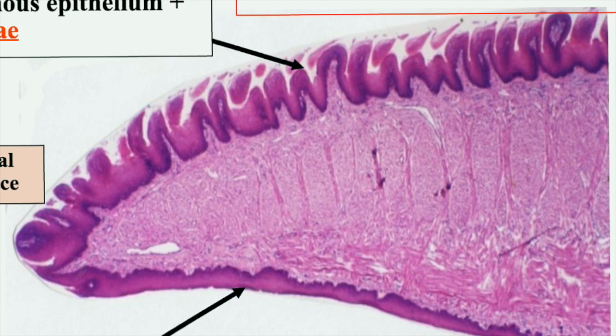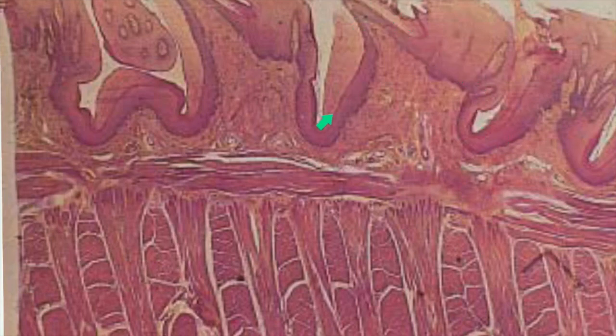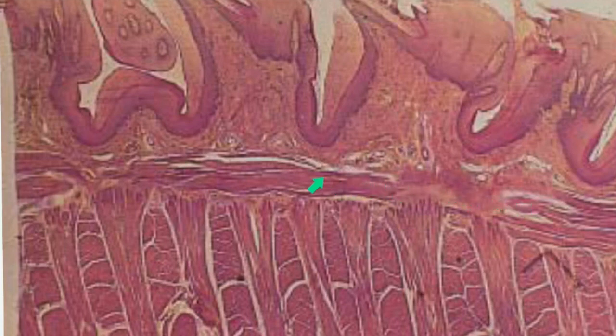This is a section in the tongue, which is present inside the oral cavity and is characterized by a dorsal surface and a ventral surface. The dorsal surface shows projections called papillae, formed of epithelium overlying connective tissue — these are the filiform papillae, which are conical in shape. The most important structure is the skeletal muscle, present in three perpendicular directions: longitudinal, transverse, and vertical.